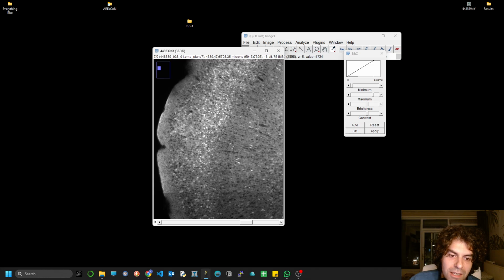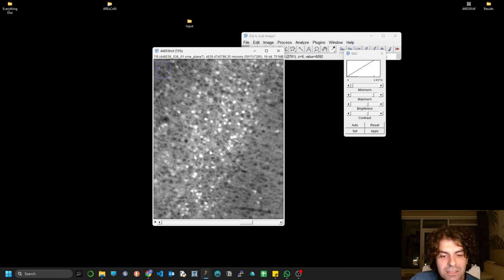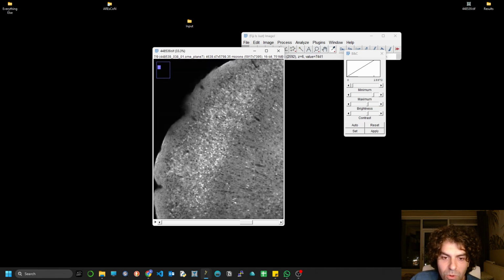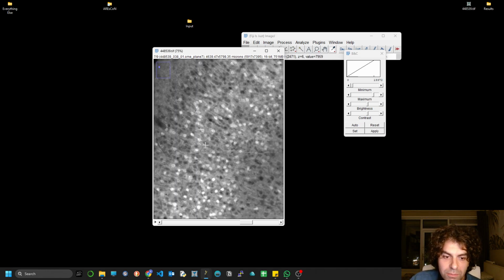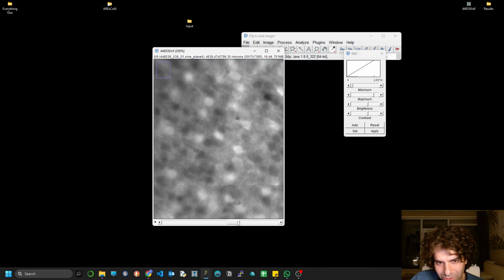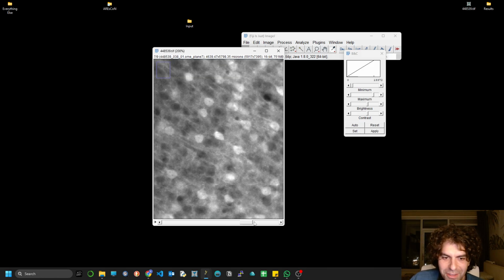So you get the idea, I hope, by now. The idea is that by using another trained network, in my case Cellpose, I want to get predictions from all planes. Of course, it can be the case that you get a prediction for that particular neuron in one plane, and you also get a prediction in another plane, which you don't want, actually, right? You would just wish that you get the crispest one.